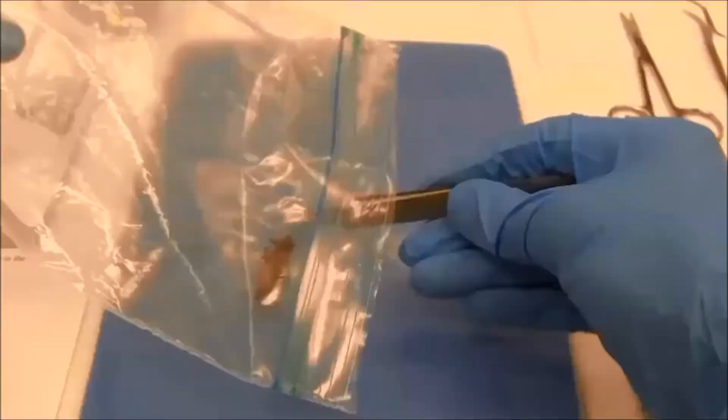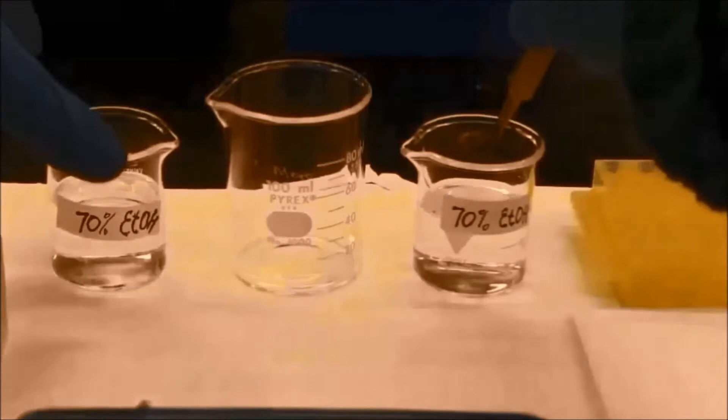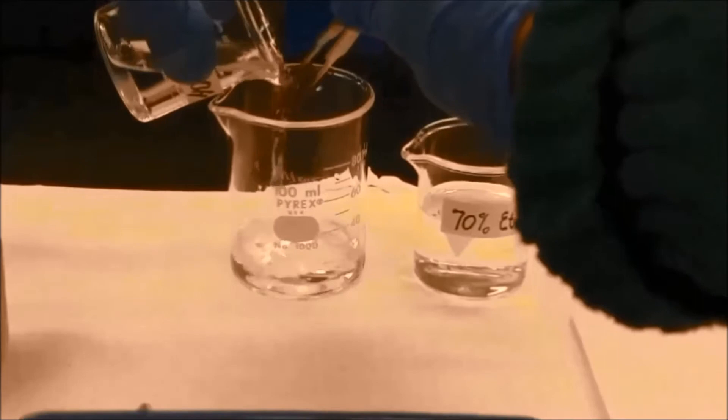First I need to take a frozen grasshopper from the freezer and rinse it immediately with ethanol. This step will clean all plant debris from the external surface of the grasshopper and prevent the amplification of non-host plant DNA.